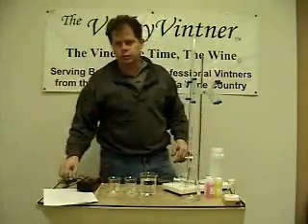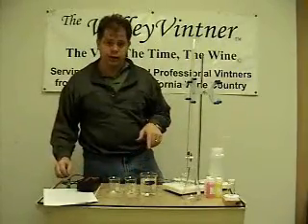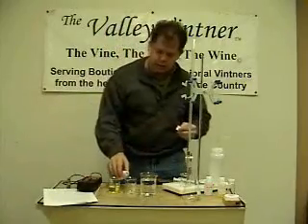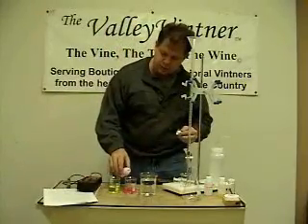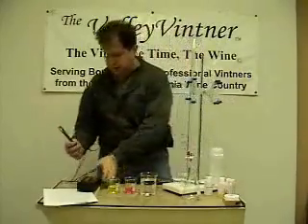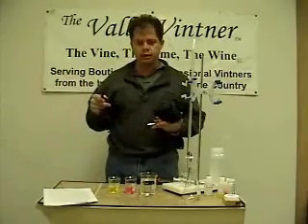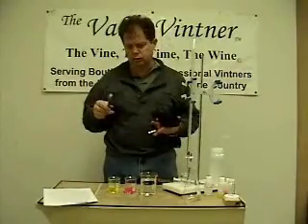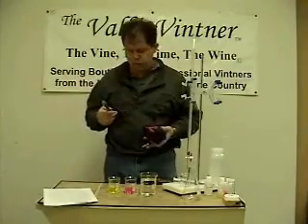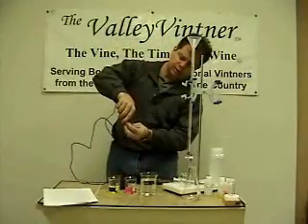The first thing we're going to do is calibrate our pH meter with our buffer solutions. You should have 4 and 7.0 buffer. To calibrate, we connect our electrode to the pH meter. I'm going to use my portable meter. This has a BNC connector, so when the electrode is spent and doesn't read well anymore, I can replace it and continue to use the pH meter. We always remove the little plastic cover that protects the electrode.